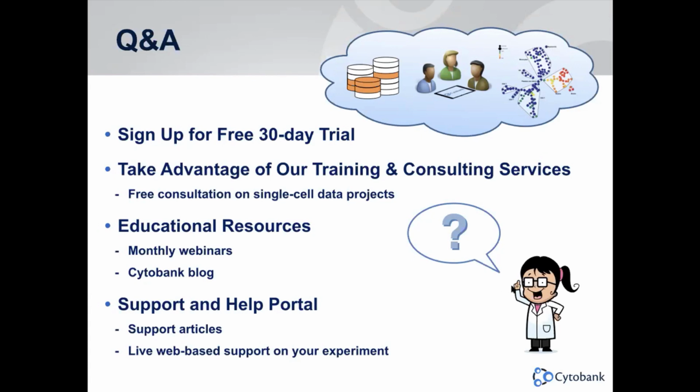So we're actually investigating this right now. We're working on a new study where we have a larger panel that characterizes gamma delta T cells in more detail. So I can say that these phenotypes are very diverse. So we see not a single population of gamma delta T cells, but at least 5 or 6 different subsets that we couldn't really characterize in detail enough in this study. So we endeavored another study that we're working on right now.